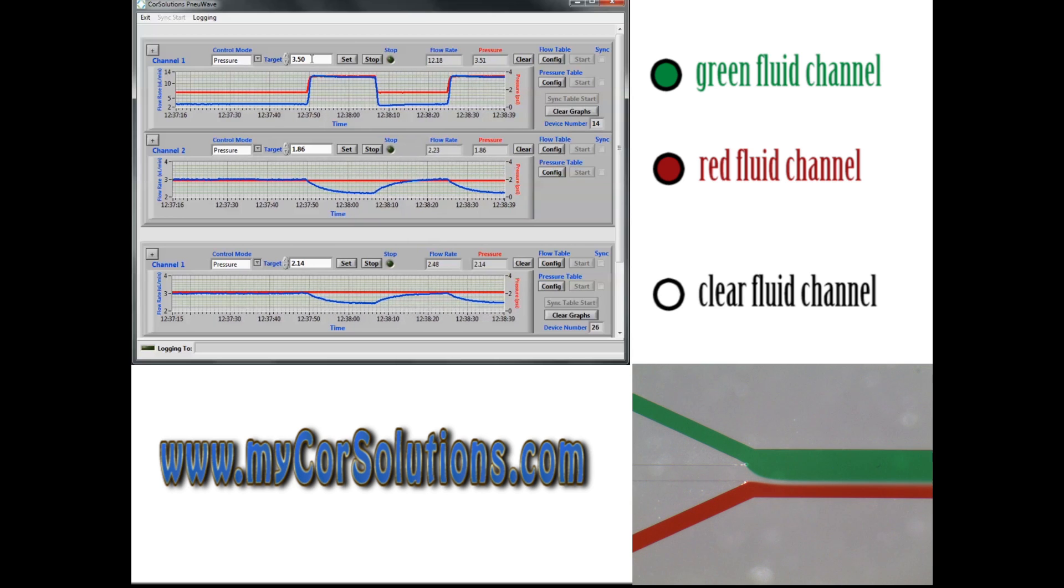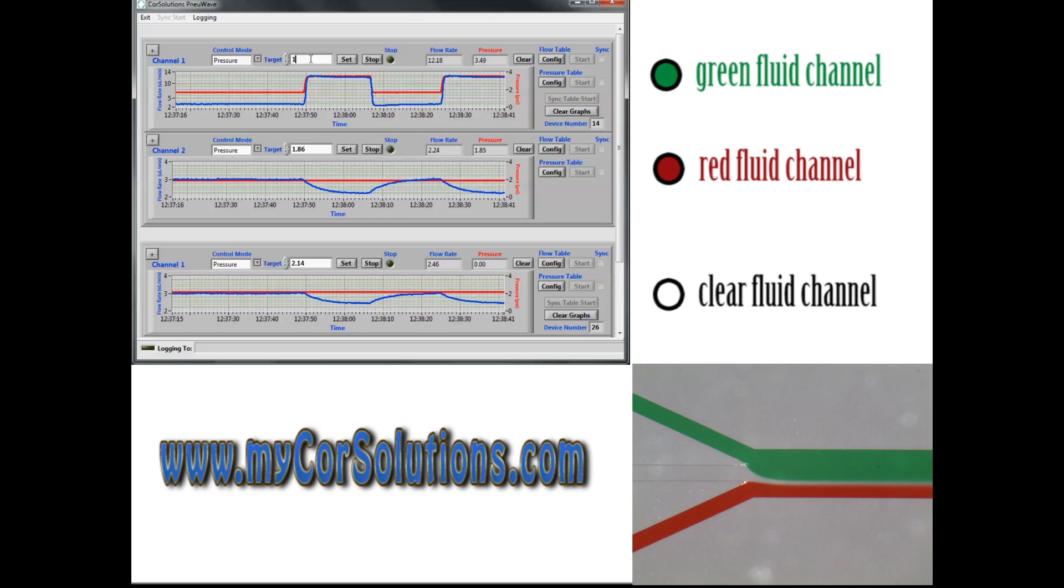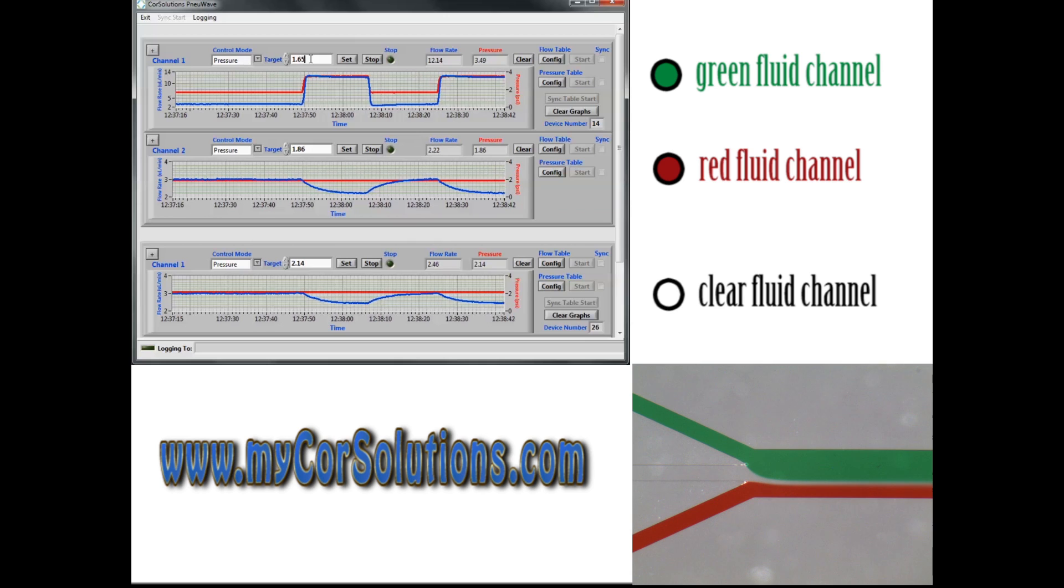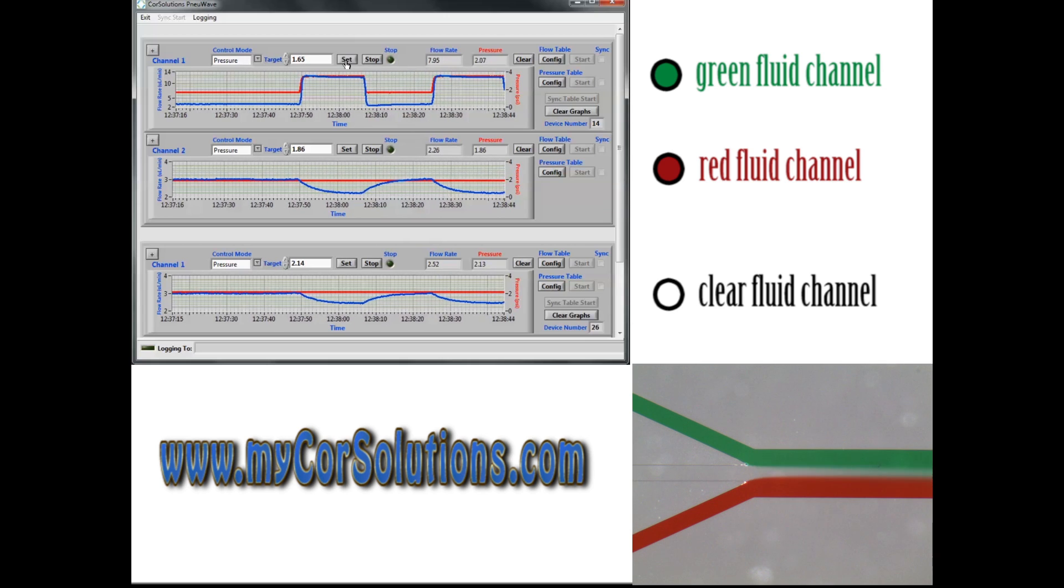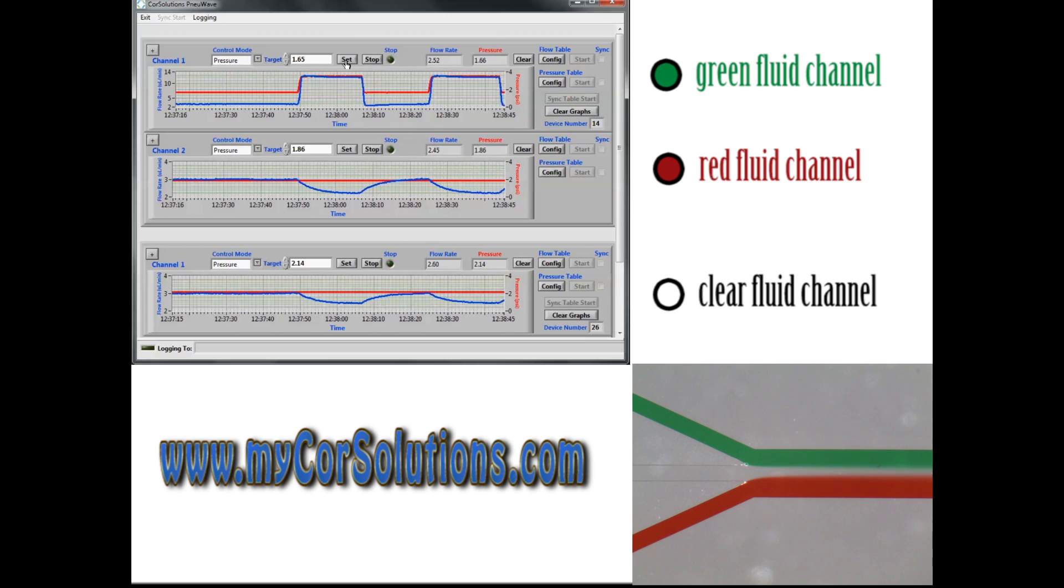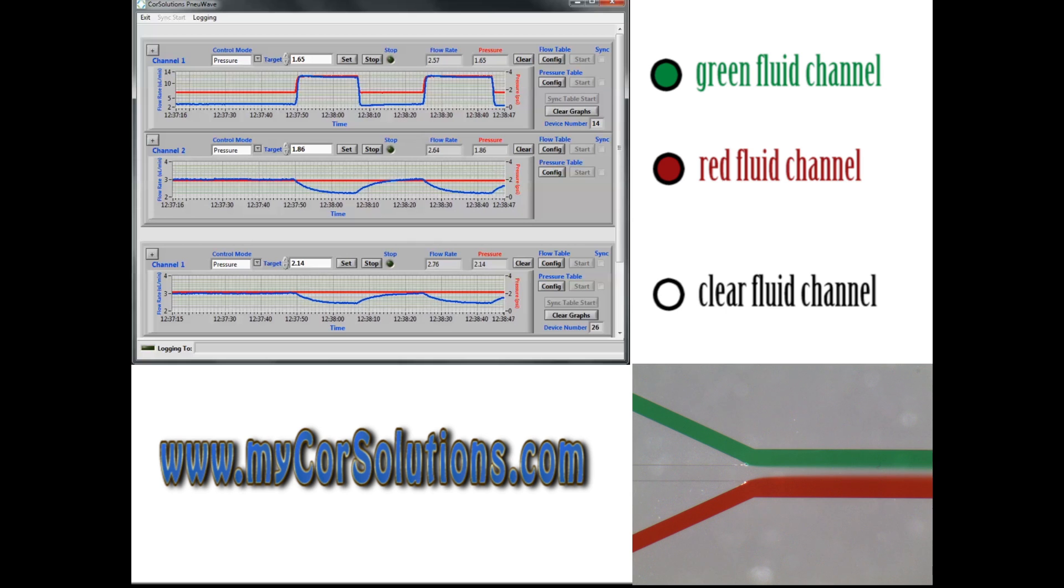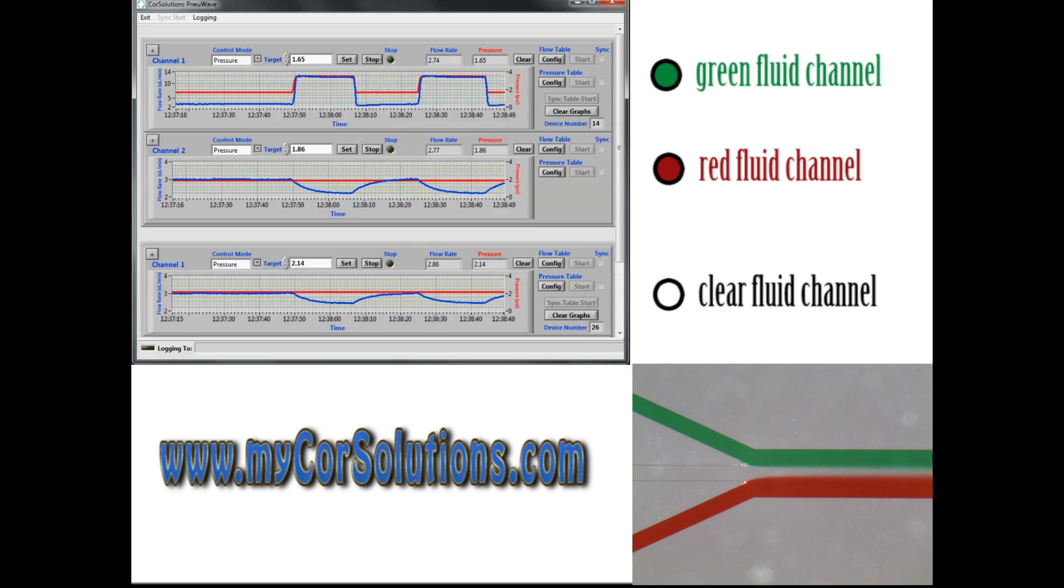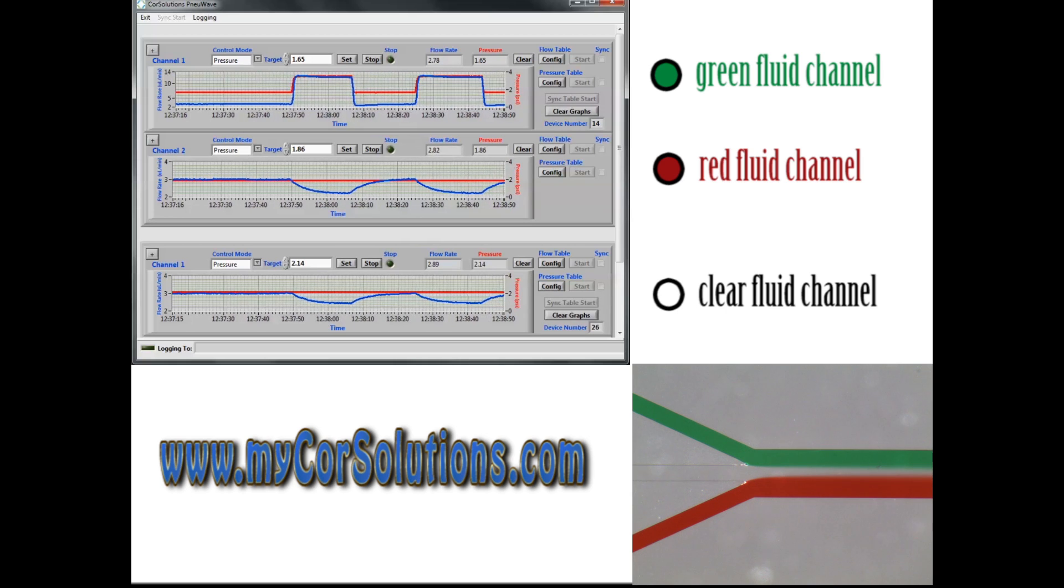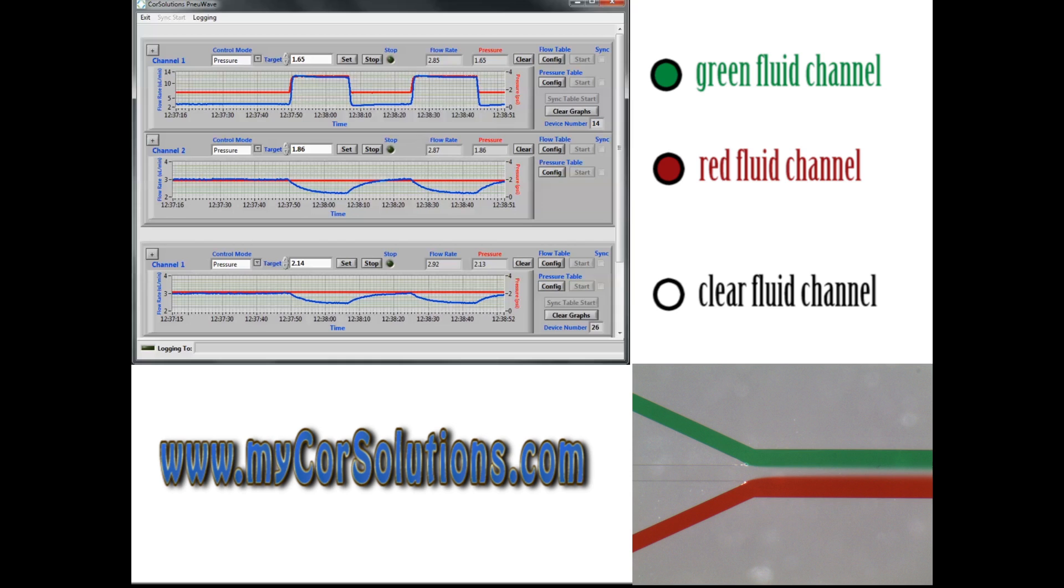The pressure set point of the green liquid is then returned to the starting value, allowing all three flow rates to return to their own starting values. The experiment is then repeated, and once again the flow rates in the red and clear channels unexpectedly decrease.